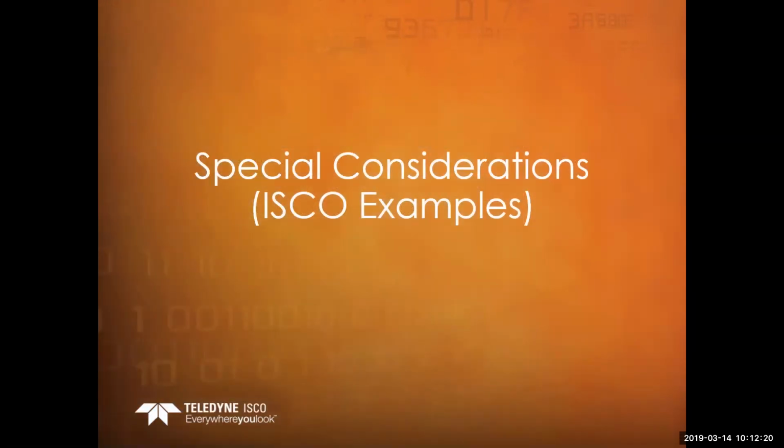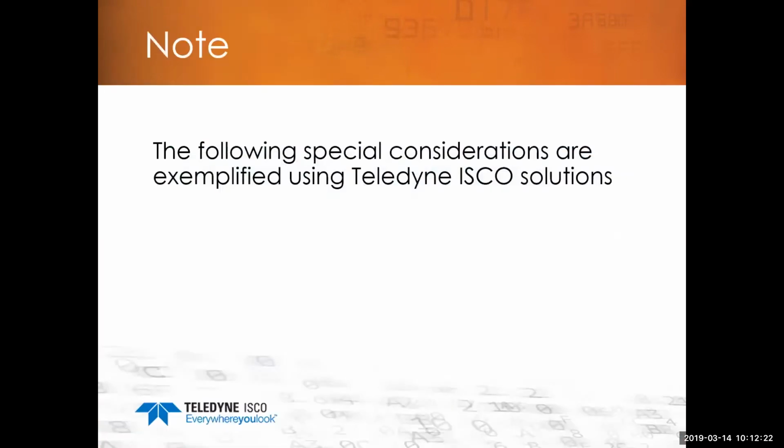So, special considerations. I wanted to say that when I show an example of these special considerations, we are focusing in on the solutions that Teledyne ISCO offers. So there are obviously other pumps out there, other syringe pumps, but these considerations, the way they're talked about, are solutions that are solved with the Teledyne ISCO product.